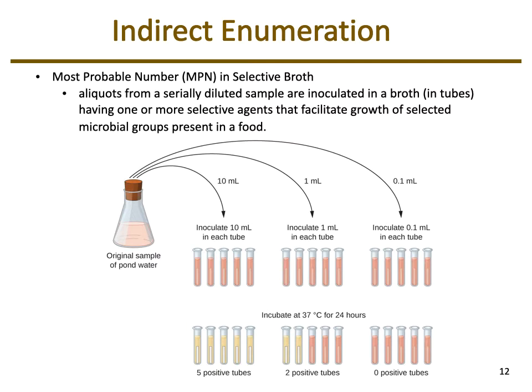So that one doesn't tend to be as quantitative. It's a little bit more qualitative, just saying you can definitely say they're there or they're not, but working back to an actual number is not as specific of a number. But there's benefits because you don't have the additional steps of plating out, so you don't need those materials. Also, the incubation time tends to be a little bit shorter because you have these higher concentrations, so they're going to react to the media quicker. They don't have to grow as much.